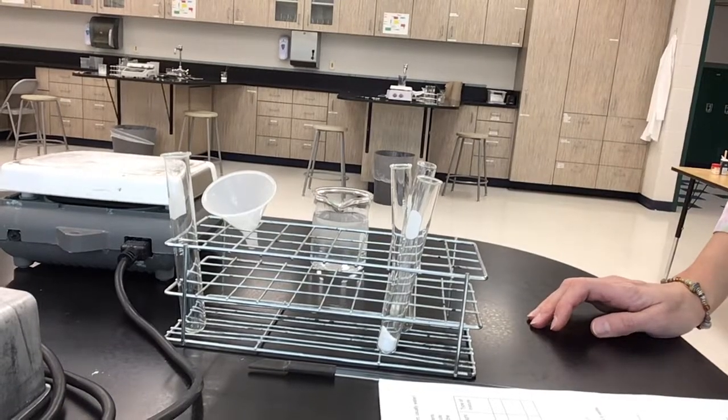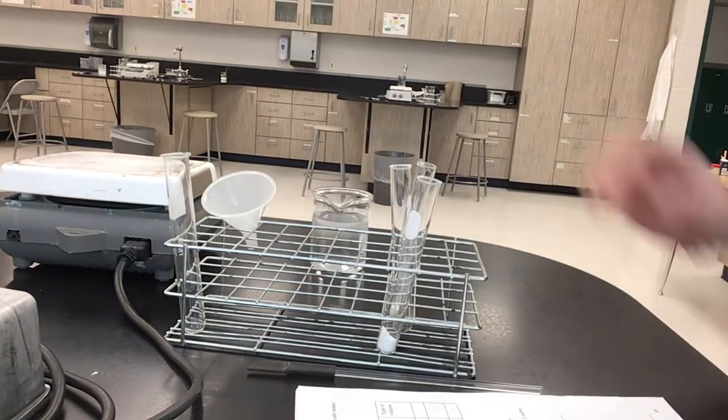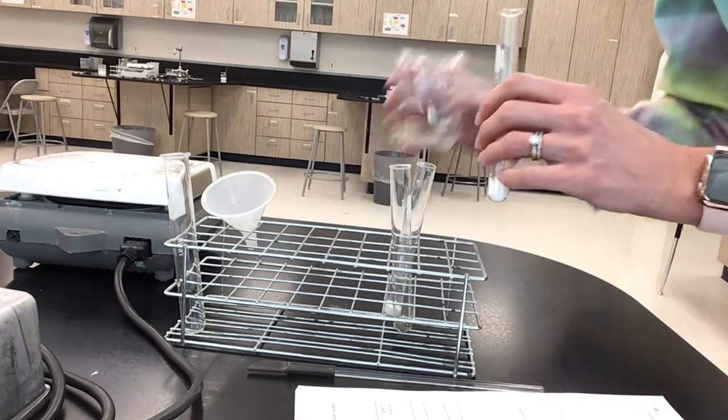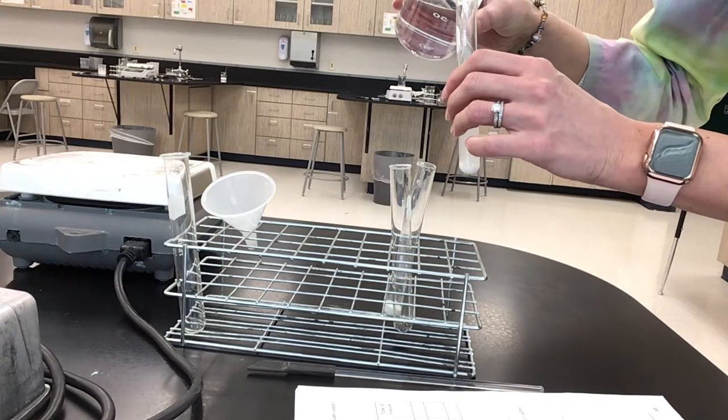Here is the first part of the mixtures lab. So the mixtures notes are on one side, and then the mixtures lab is on the other. So my first one is I have alum and water. So I'm gonna put a little bit of water in here. About halfway full it says.